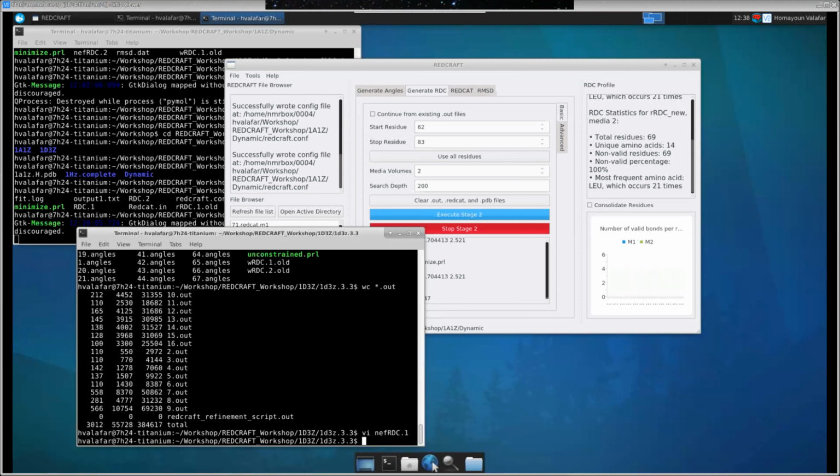followed by another helical region that has residual dipolar couplings, but only one RDC per alignment medium, then my recommendation would be to approach the structure calculation in a more fragmented way. First calculate the structure of fragment 1 and optimize that, calculate the structure of fragment 2 and optimize it, then orient the two fragments with respect to each other.